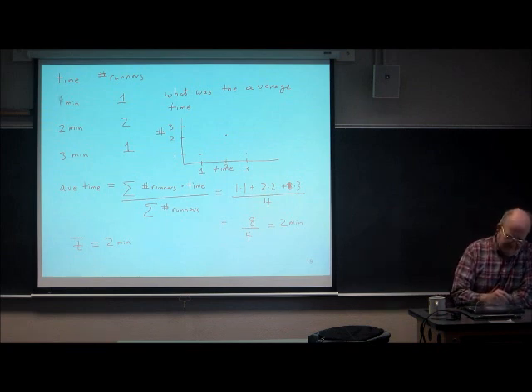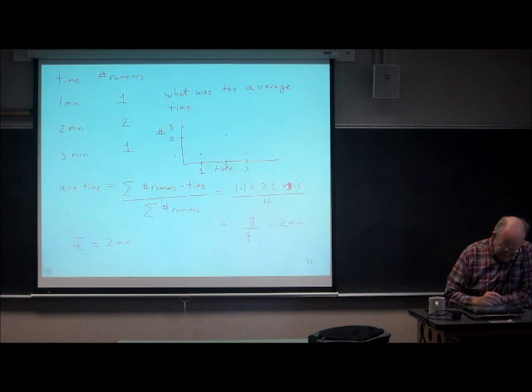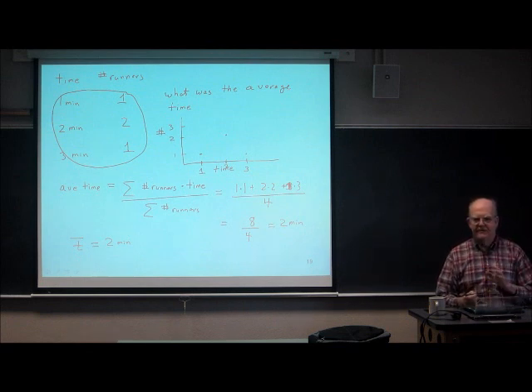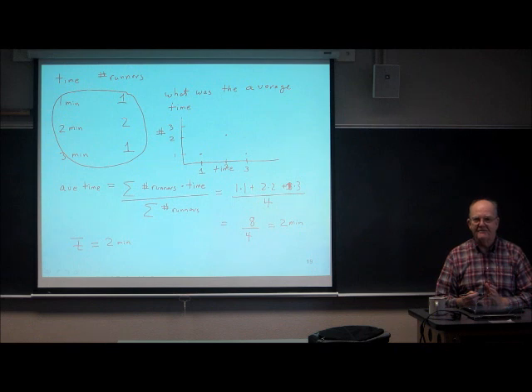Okay, so here's the numbers. We can plot the numbers. If you don't like arithmetic, look at the numbers. Look at the plot. It's not hard to figure out what the average time is. But if you had a lot of numbers, you wouldn't be able to tell.